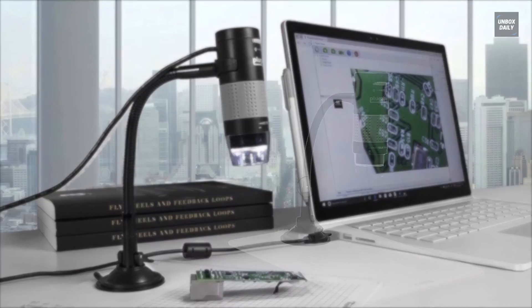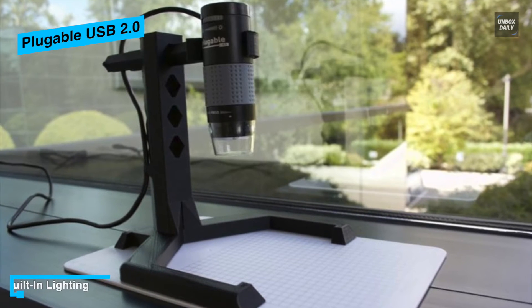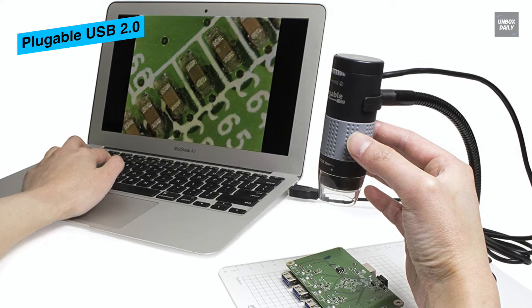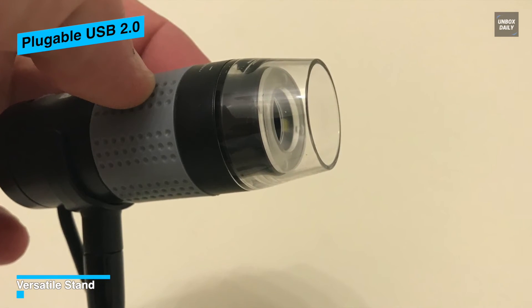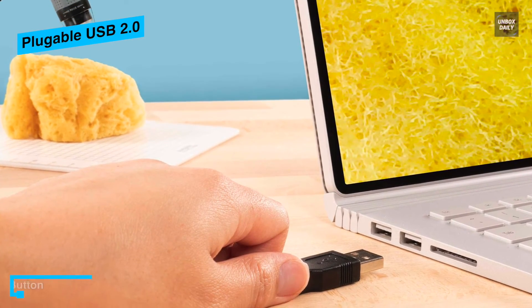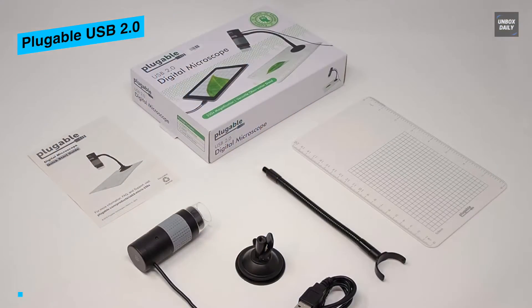The Pluggable USB 2.0 Digital Microscope is a basic device that projects objects onto a digital screen via a USB port. The magnification is decent, it's easy to install, and is best suited for primary school-aged children. It works with its own app downloadable on Mac and PC, as well as with photo booth on Mac, Windows Camera on PCs, and Linux. Priced at $39.95, the bottom of the camera has a small suction cup attaching to a plastic sheet with a printed grid, useful for measuring specimens.